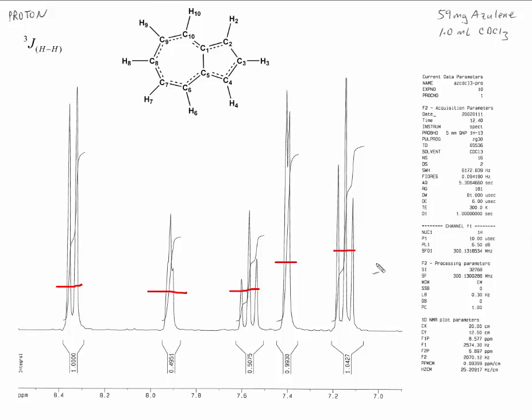Now there's more than 5 peaks because each signal coming from these atoms is split. We have splitting in a proton spectrum. What does that do? Well, remember, every time we see a peak, whether it's this entire collection here or one of these individual peaks, every time we see a peak in the NMR, it's because there is a nucleus responding to a magnetic field. And so even though the nucleus for one of these protons is giving a signal, it's affected by neighboring protons in terms of the local magnetic field that it sees.